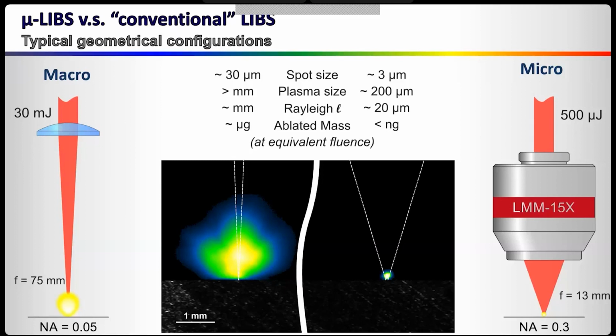It's not huge, but high. And as you can see, we have an almost perfect overlap between the incident beam and the plasma that you are generating. And this is very cool because your plasma will be much more homogeneous than here, where the energy is brought to the plasma center, while here, the energy is more homogeneously distributed. So we have a better atomization, better homogeneity.